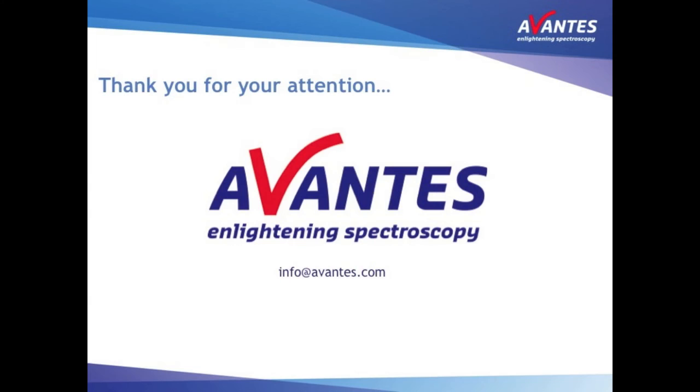This concludes the relative irradiance mode in Avasoft. We hope you will find this tutorial useful.